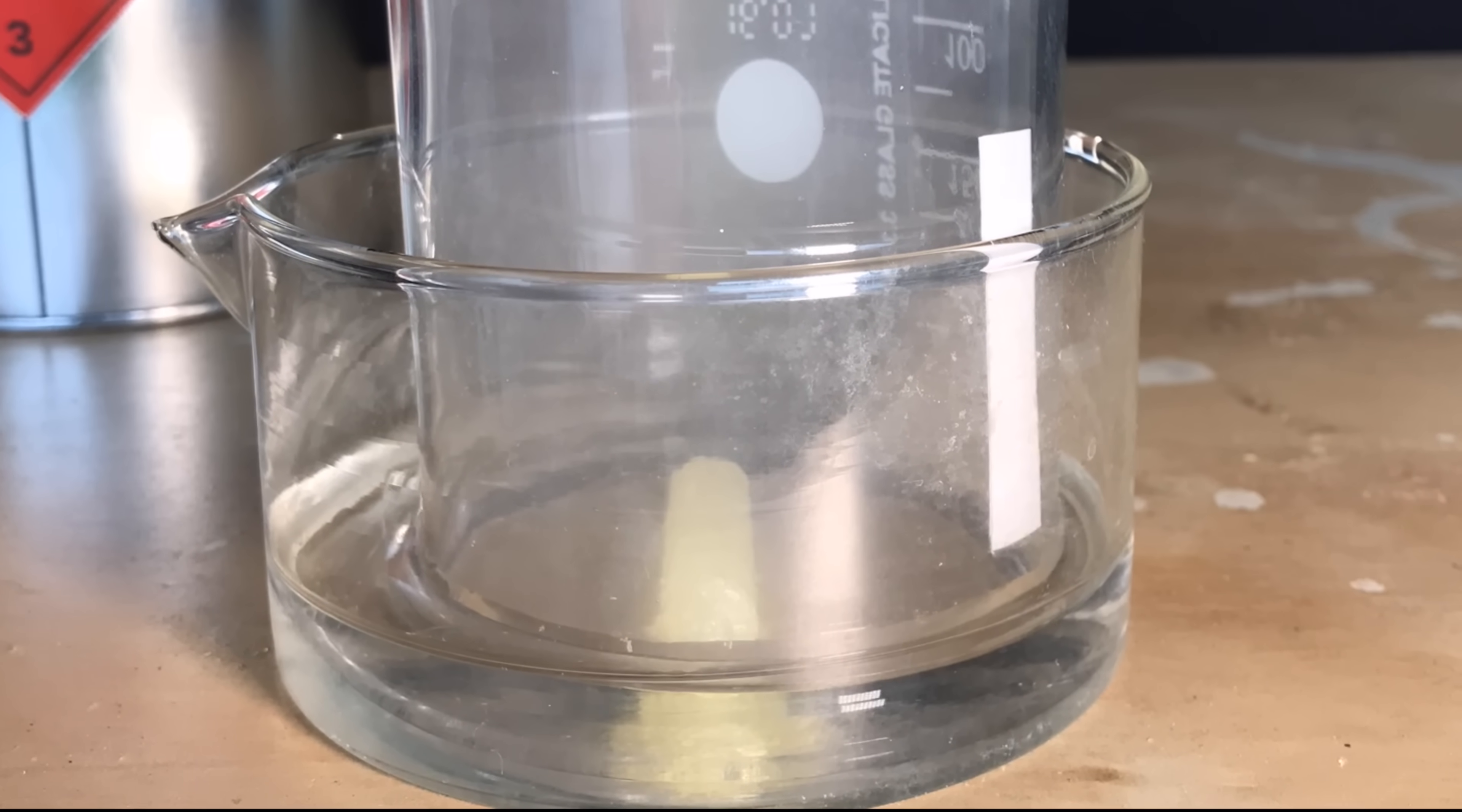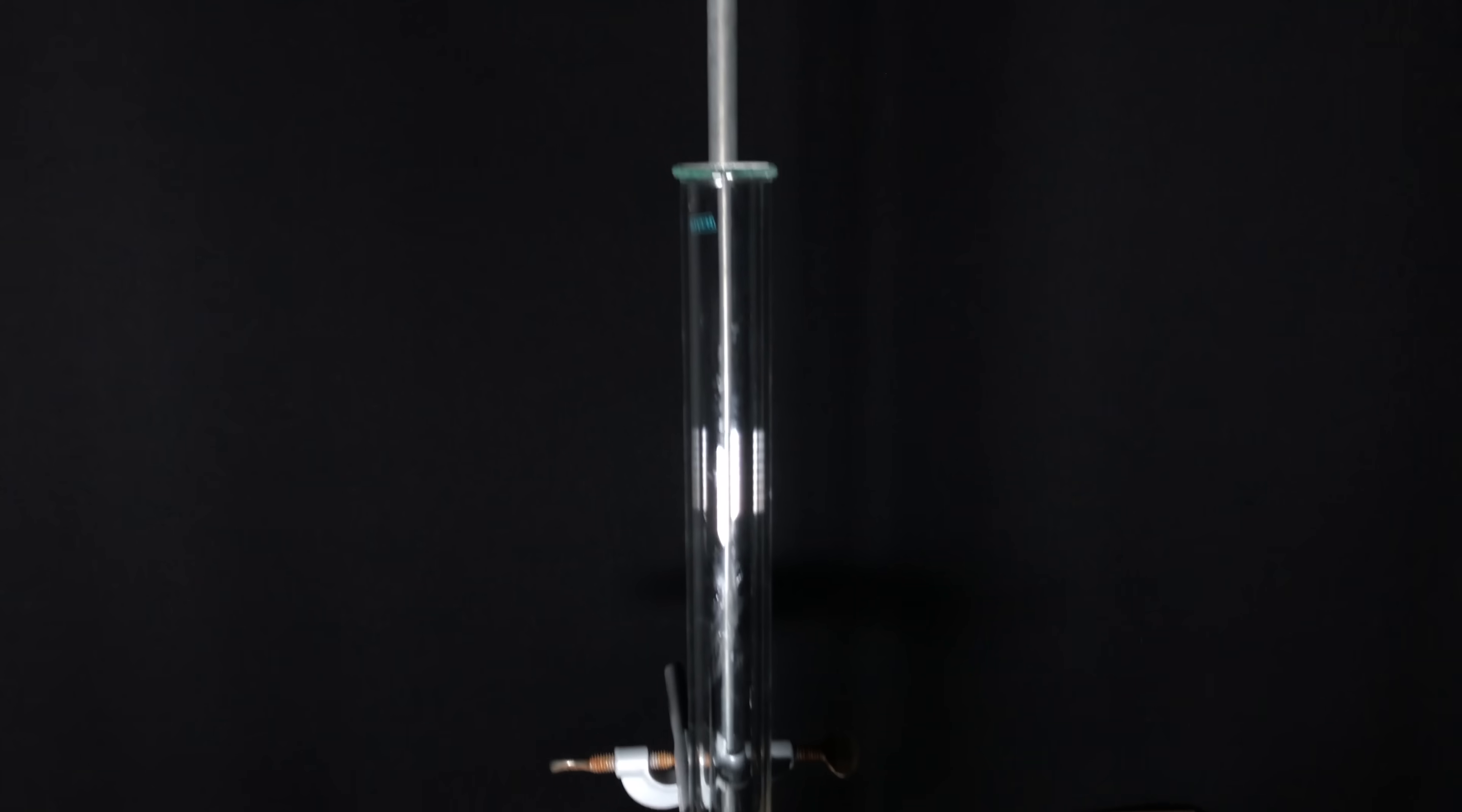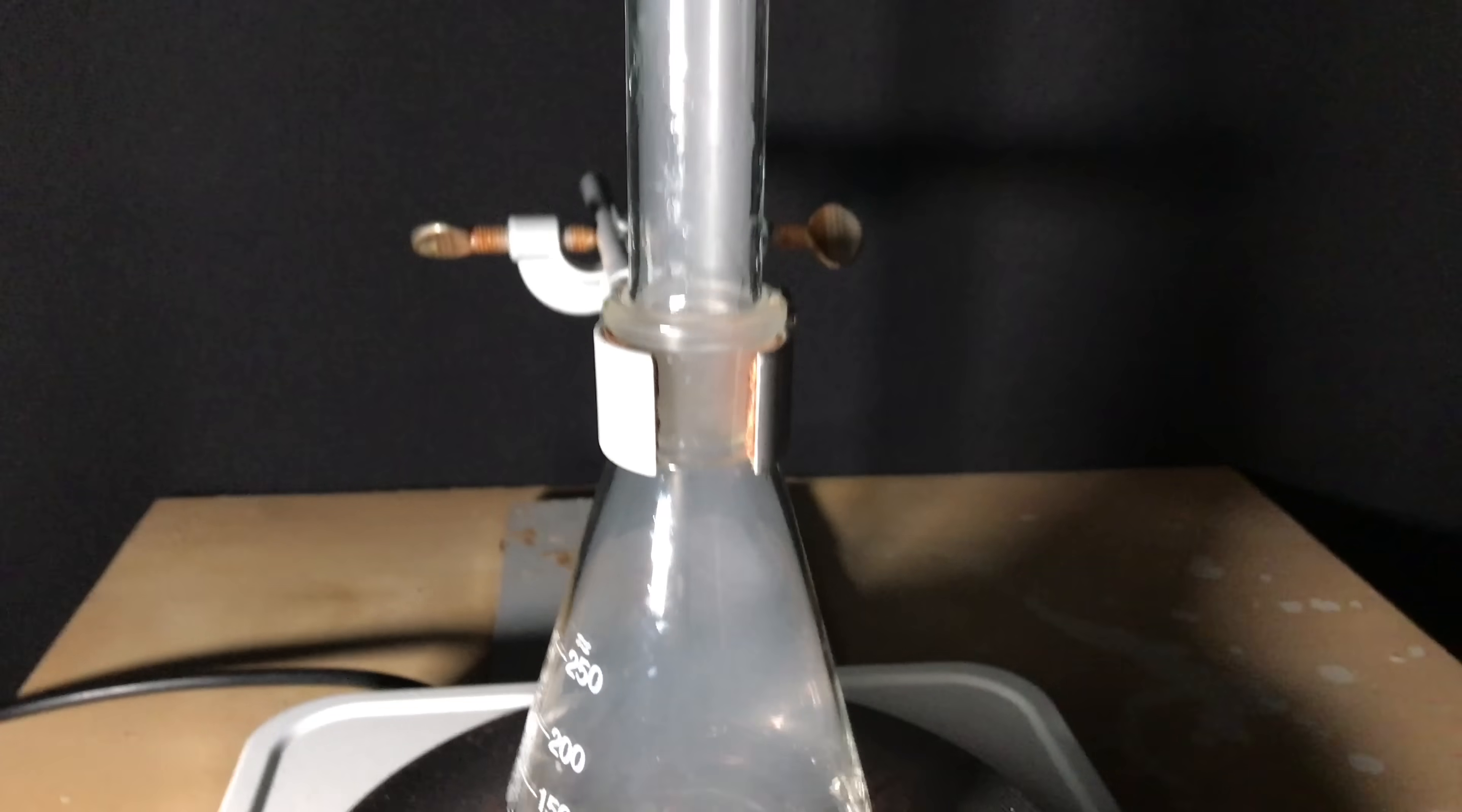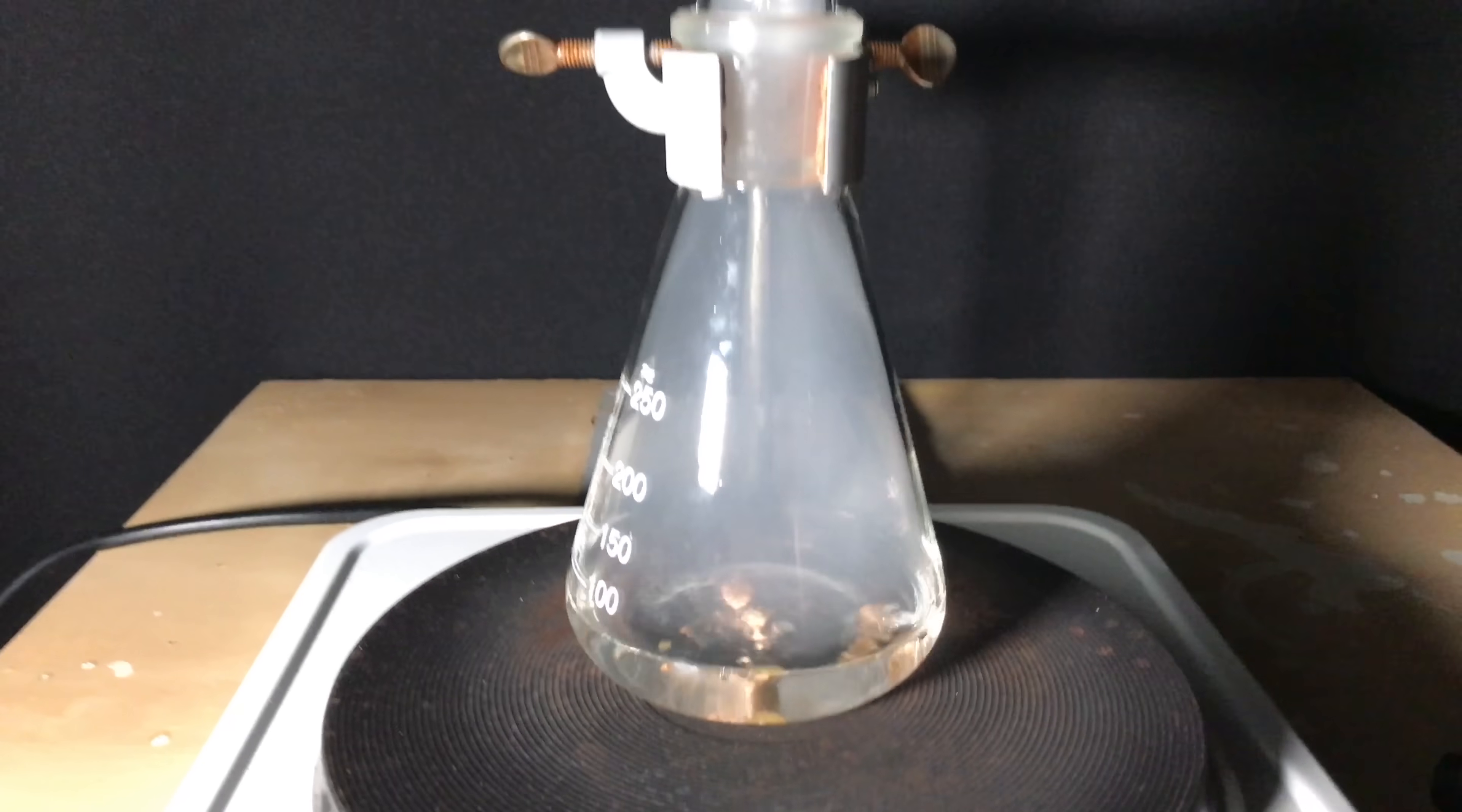I have now shown you a few reactions with phosphorus. But what if you were poisoned by it? What did they do in the past to test for phosphorus poisoning? Today there are much better methods, but in the past they used this very simple apparatus. Whatever substance you wanted to test for the presence of white phosphorus was placed into a flask containing a small amount of water and a long tube was placed on top of it. This method works for even the smallest amount of white phosphorus. You have to bring the water or the substance to a boil and have to observe while dimming down the lights.